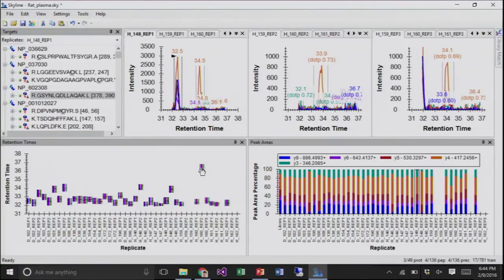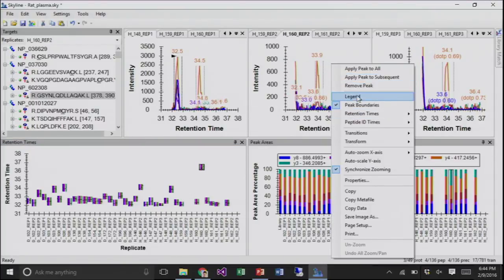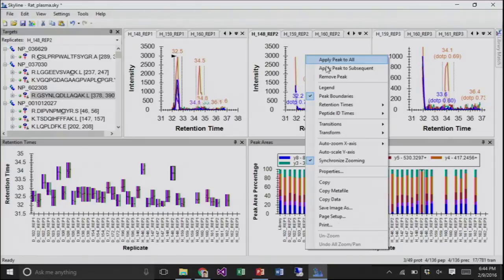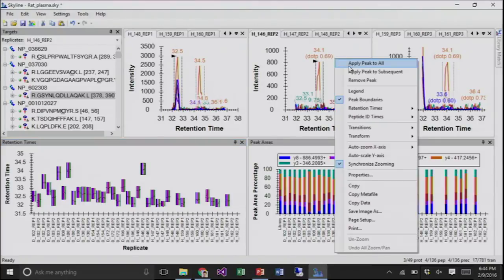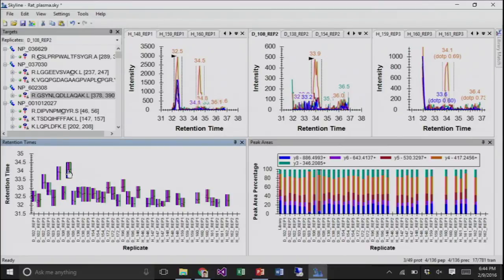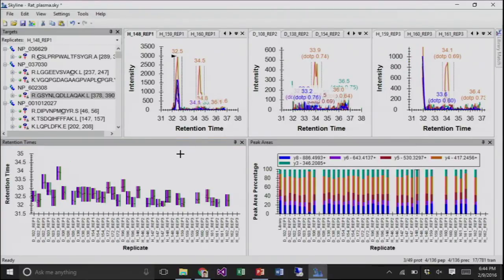I'm not sure whether we would end up with enough measurements in this case to actually do statistics on this. I'm betting probably not. So maybe we really just wanted to delete this thing.